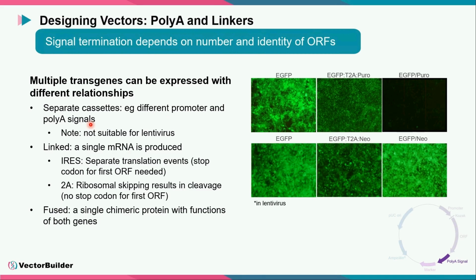However, it's worth noting that this is not suitable for lentivirus because if you are making a lentivirus transfer vector, you cannot have an internal polyA signal because that will greatly reduce the titer of your virus.